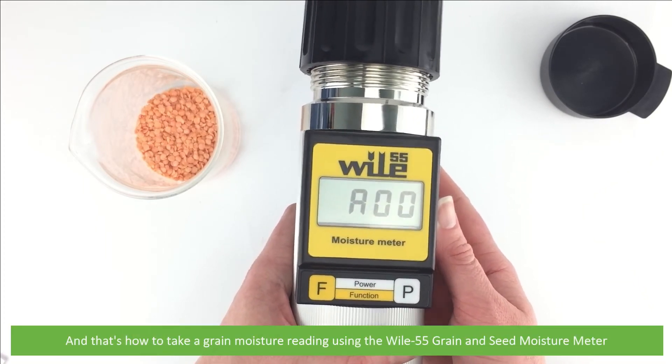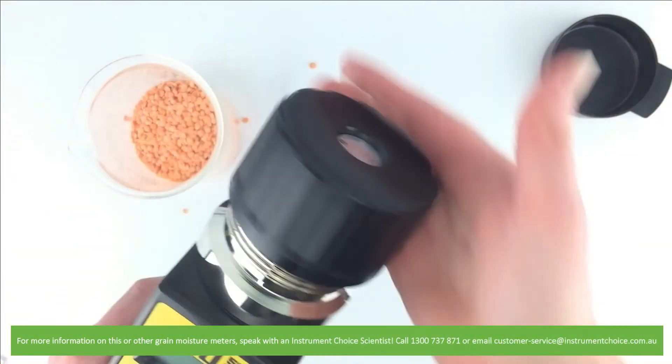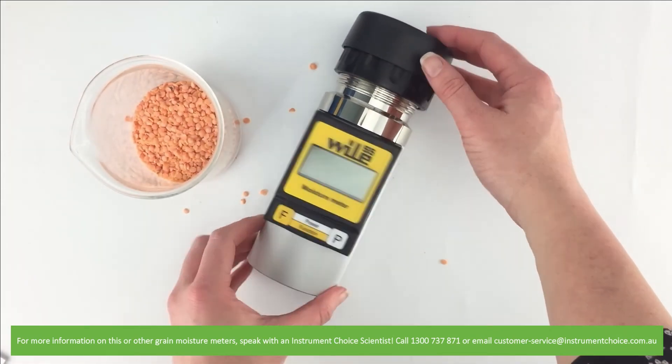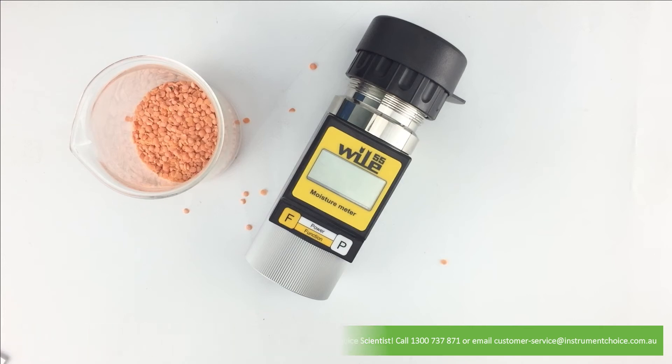And that's how to take a grain moisture reading using the Wile-55 grain and seed moisture meter. For more information on this or other grain moisture meters, speak with an Instrument Choice scientist. Call 1300 737 871 or email customer-service at instrumentchoice.com.au.